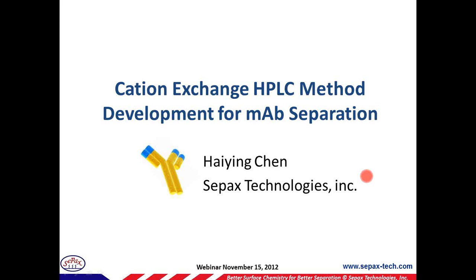During many of our technical support sessions, we get a lot of questions on protein separation, such as where to start and how to optimize the separation conditions. So we hope today's webinar will take away some of the difficulties and also shed some light on the method development for the large biomolecule separations. Our webinar will focus on the cation exchange method development, particularly for mAb separations.